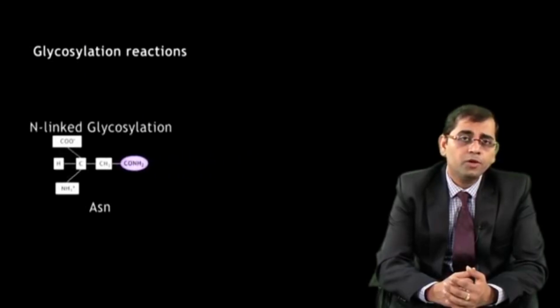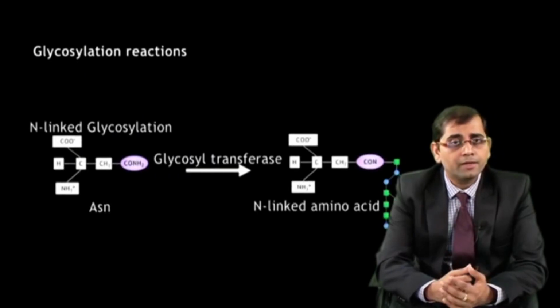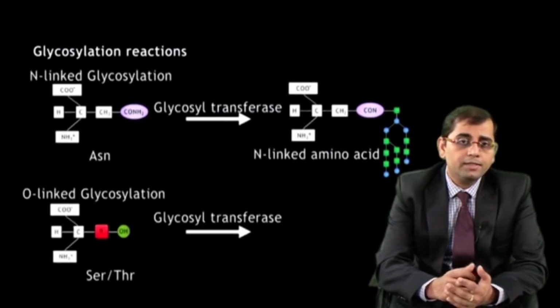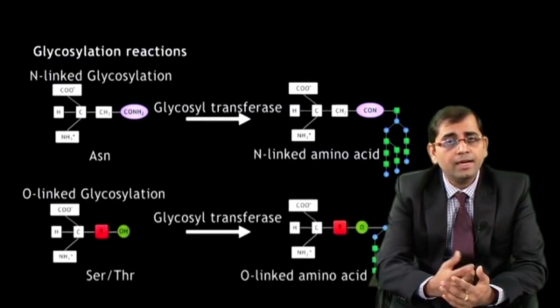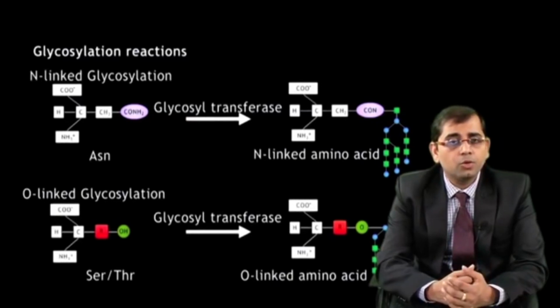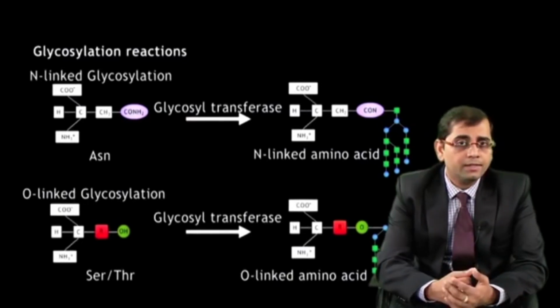Post-translational modification analysis using mass spec is one of the challenges. Additionally, the dynamic range of proteins, inadequate coverage of the whole proteome, and accuracy of quantification are challenging in this field. Overall, this course will provide the basic knowledge of mass spectrometry with a focus on quantitative proteomics. Hope these concepts and understanding will be useful for your research.